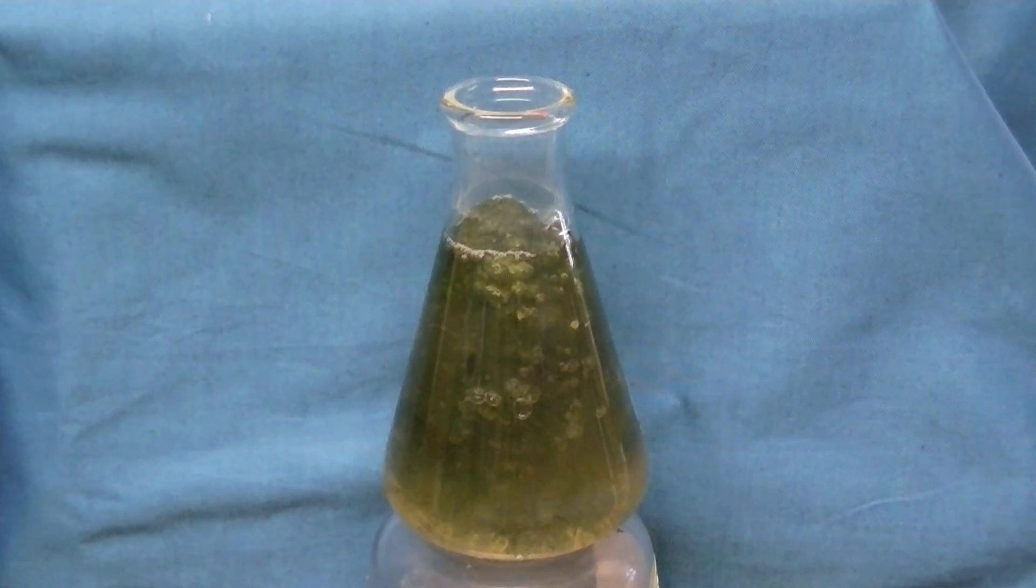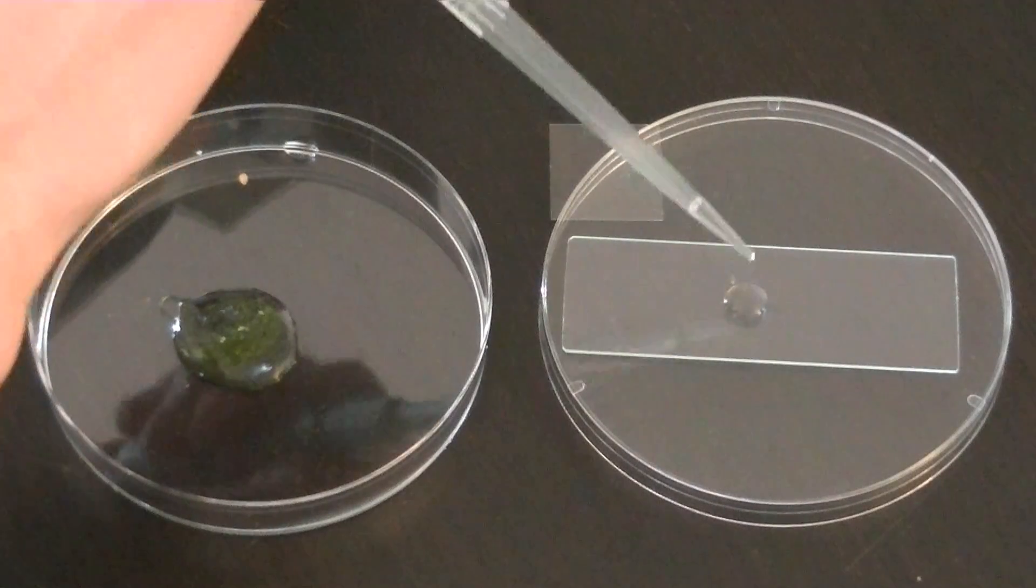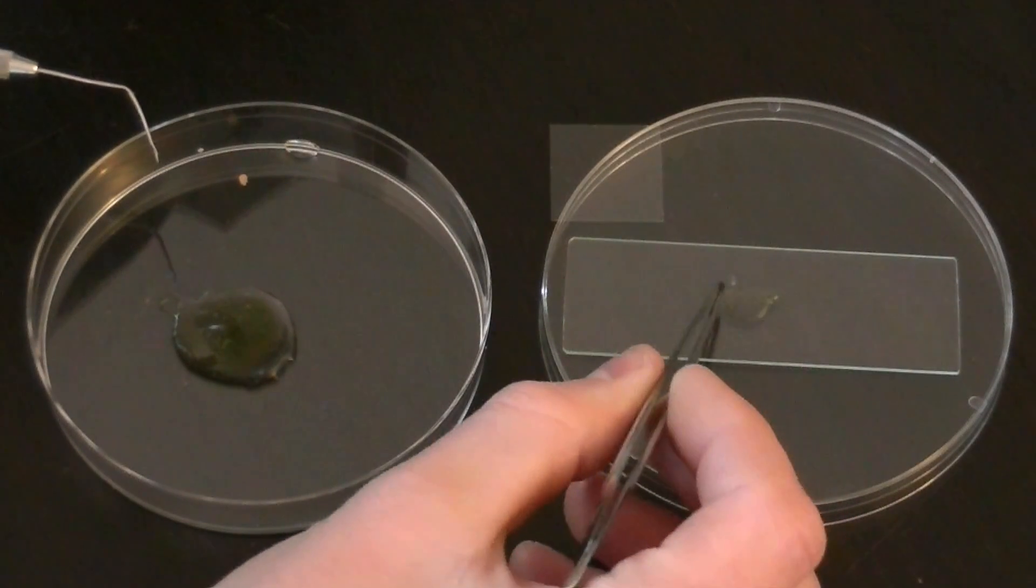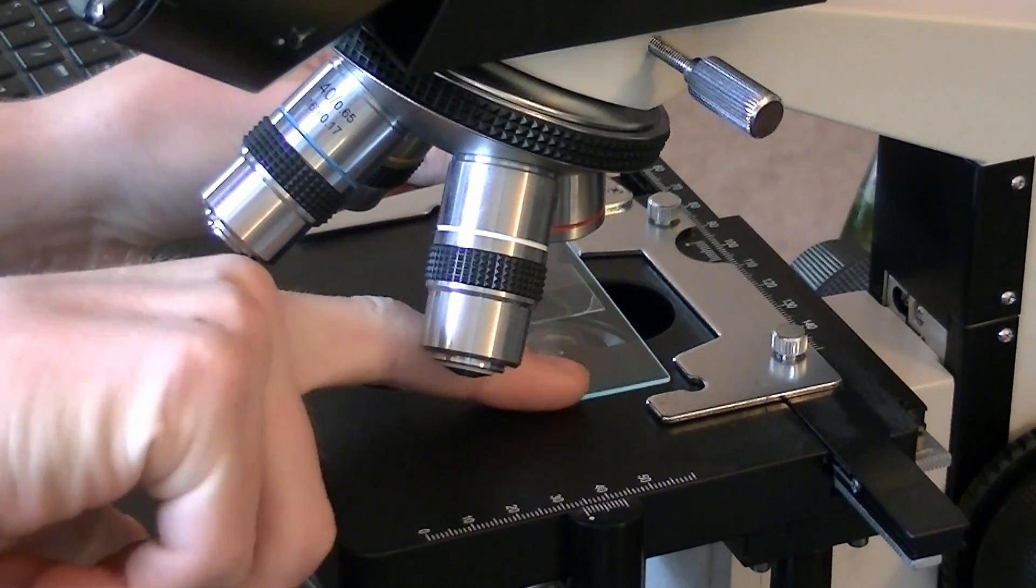We're going to start this video by preparing a slide of some hair algae which we've cultured over the past few weeks. We place a small drop of water onto a slide followed by a very small sample of the organism. Then we set the slide onto our compound microscope for viewing.